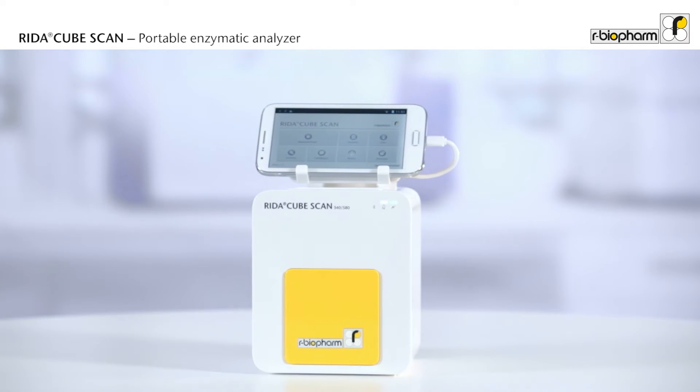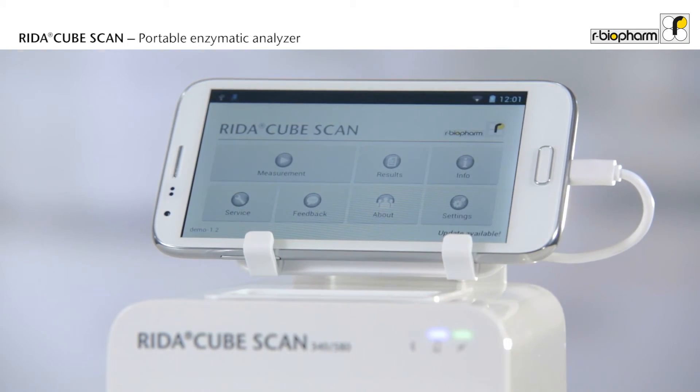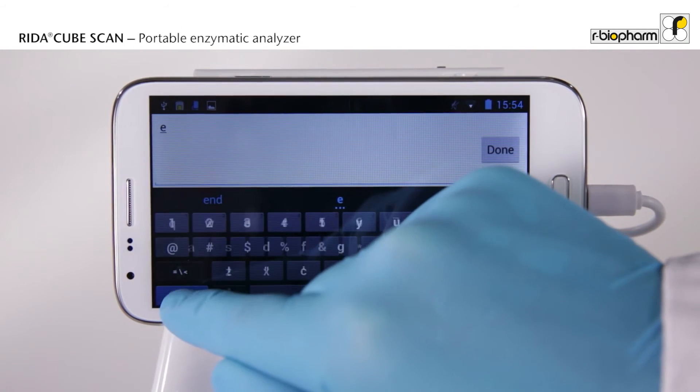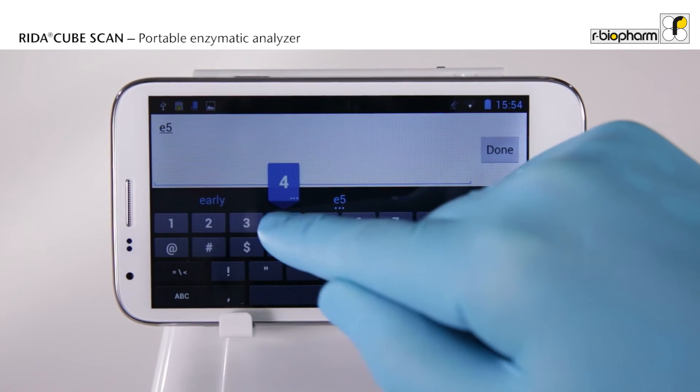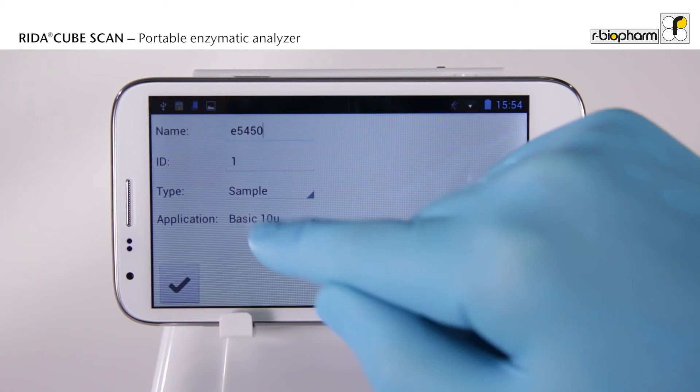The instrument is entirely driven through a tablet with a simple and intuitive app. Type in the sample identification and choose your sample size.